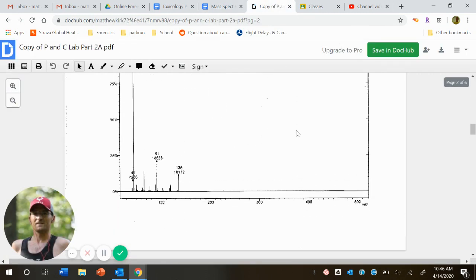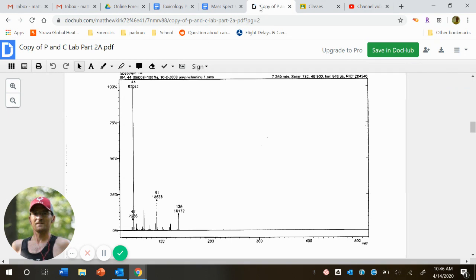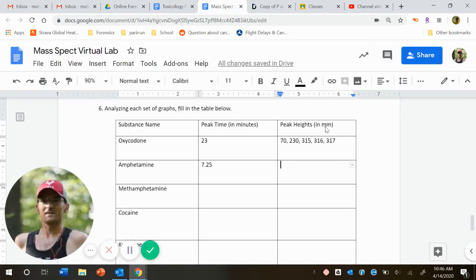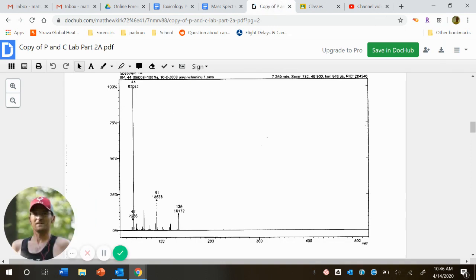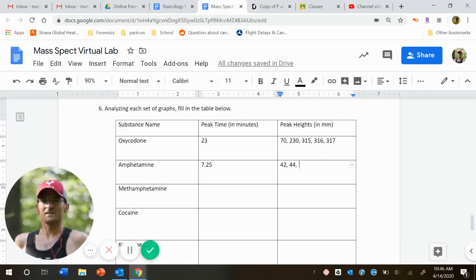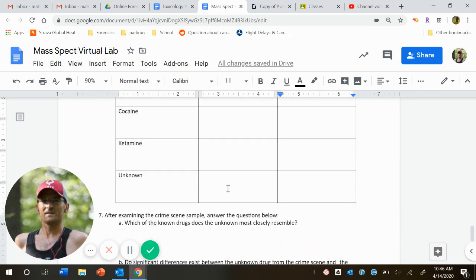And then our peak heights. Okay, 42, 44. So 42, 44, 91, and 136. And then I would continue doing these for the rest of our drugs.